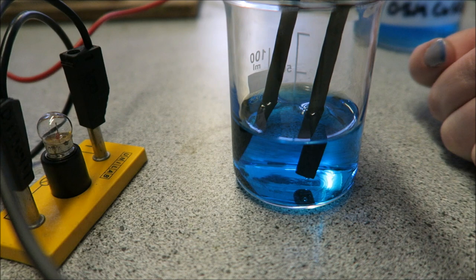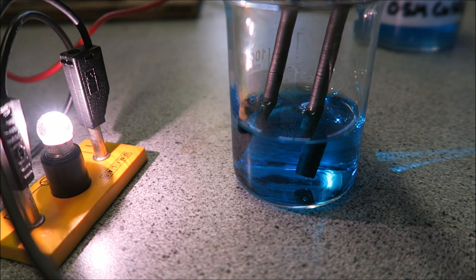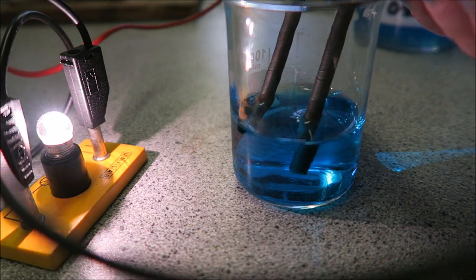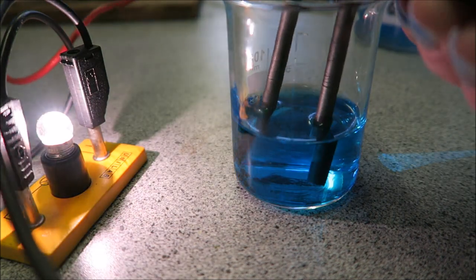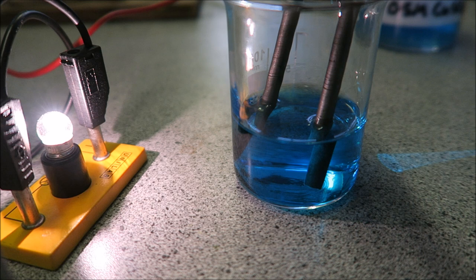I'm just going to turn it on and you'll see that the bulb has come on, indicating to us that the circuit is now complete. If I just take these out of the copper sulphate solution, you'll see that the bulb goes out and then back in. You can see the bulb goes on, showing that putting the electrodes in the solution completes the circuit.